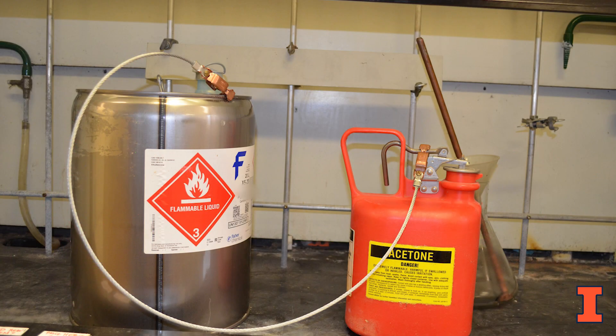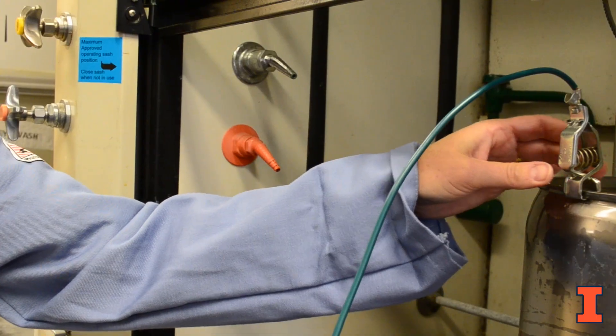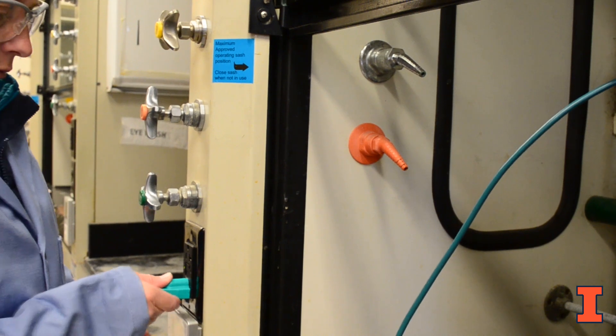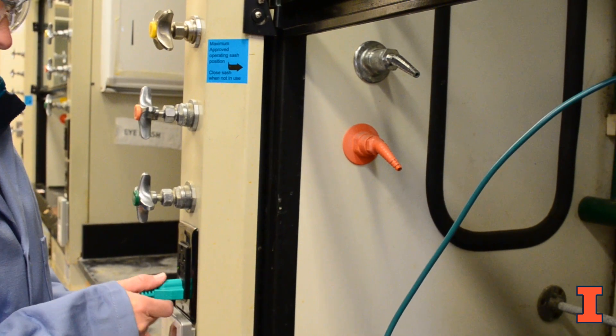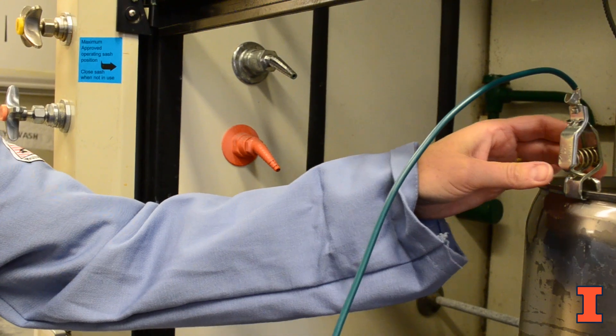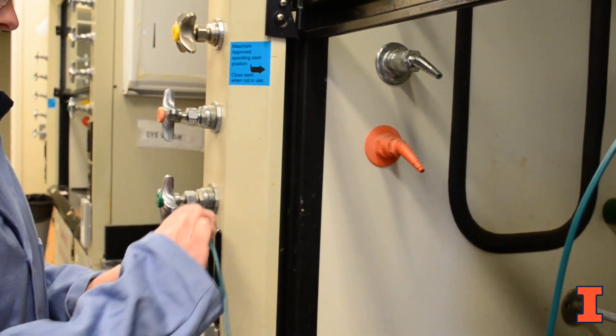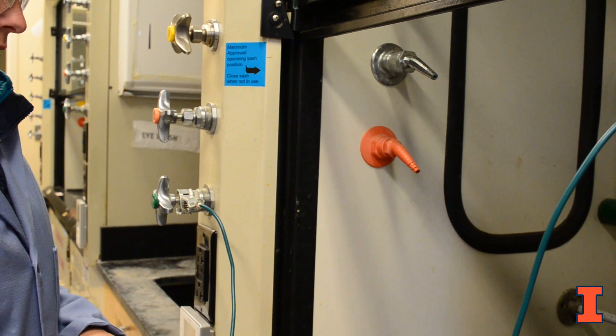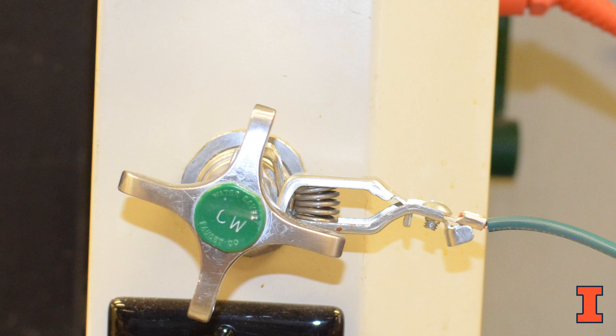Now that we have equalized any potential difference between the two containers by properly bonding them, we must safely dissipate any charge buildup to earth by grounding. For grounding, electrically connect the dispensing container to a certified grounded three-prong electrical outlet as shown. If your building has a pre-installed grounding rod or bar or cold water pipes like the ones located on the sides of a fume hood, you may ground your dispensing container to them, as long as your pipe system is continuous and does not have any circuit interrupters.